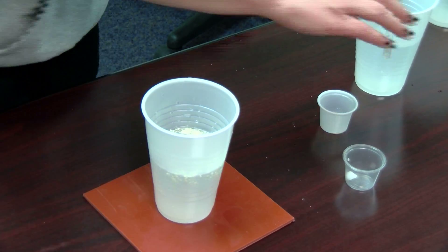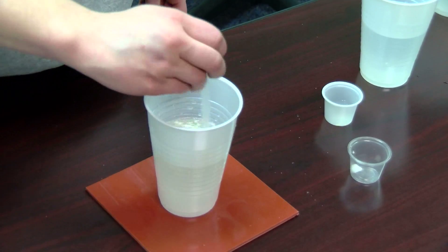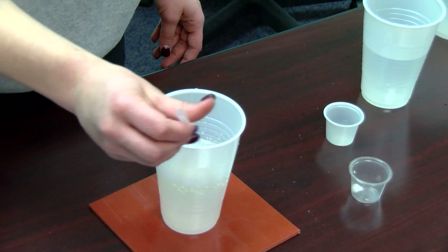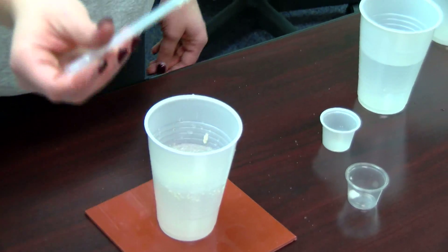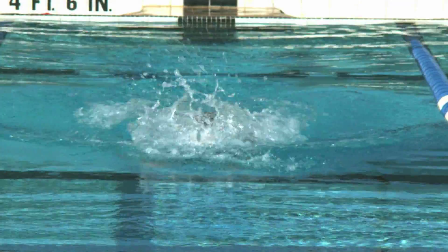Once we do that, we are going to stir around the solution to help create the nylon, which you will see forming. And as you can see here now, the nylon is coming out. We are going to let it dry and it will be the nylon that helps create the swimsuits.